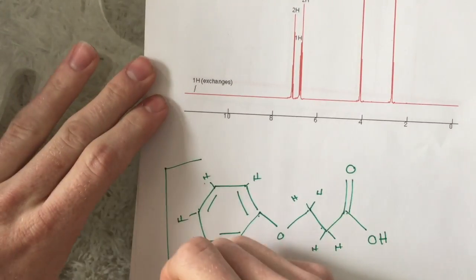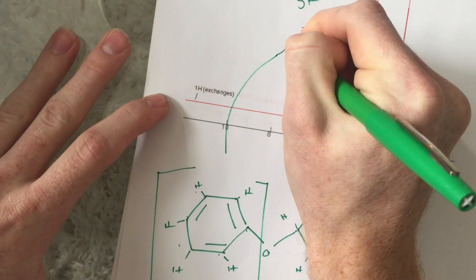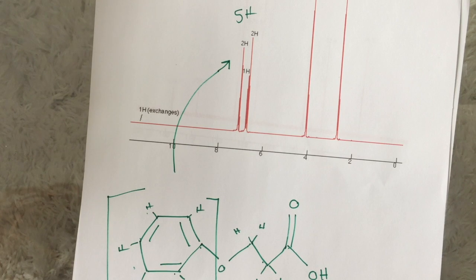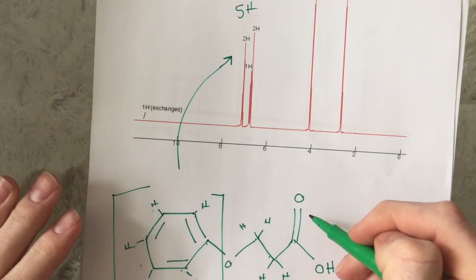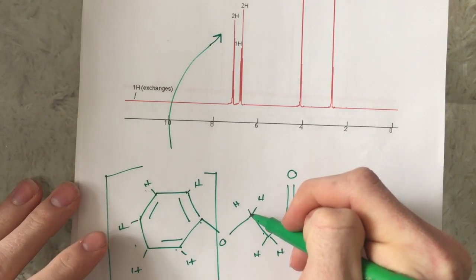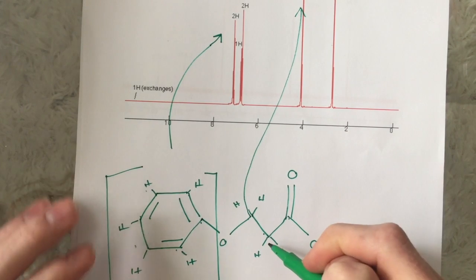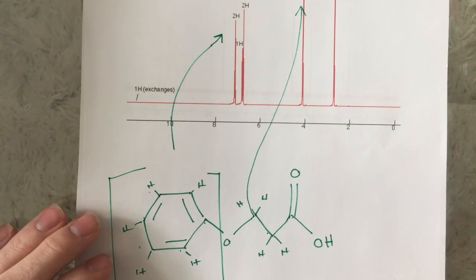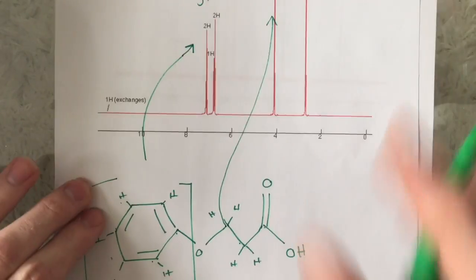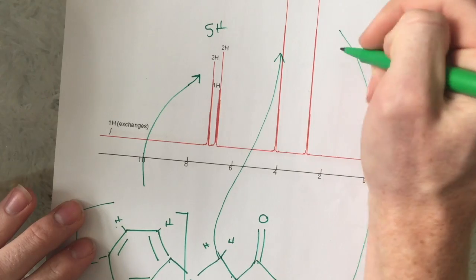So we're going to do a little bit of this, and bring this on up here, because there are the 5 hydrogens. And with this, we don't necessarily see the splitting since it's only protons. On the carboxylic acid, we are going to assume that the 2 splitting, since there are 2, goes off of the N+1 rule, and looking at the adjacent carbon, we have this over here referring to one of the peaks, and also the carbon over here referring to the other one as well.